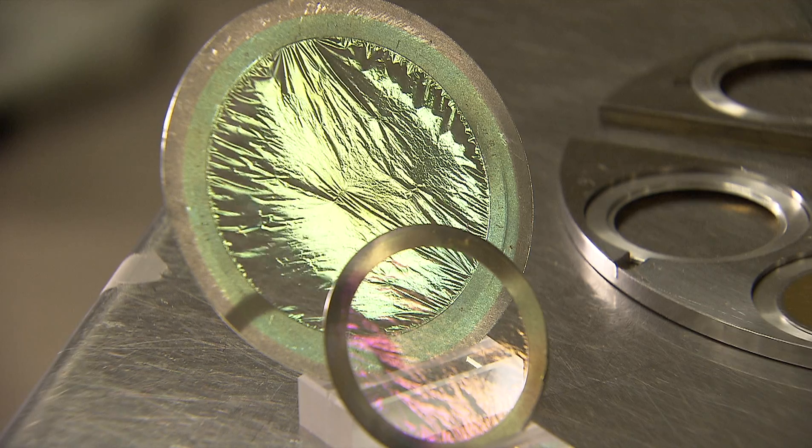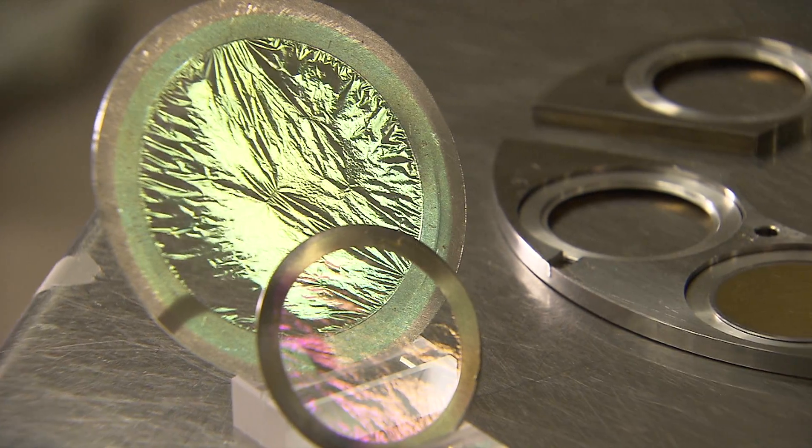For each step in this process, a separate evaporator or glove box is used, dedicated to the isotope.